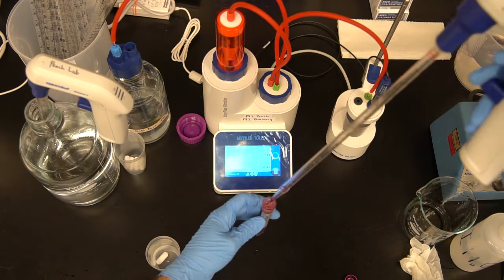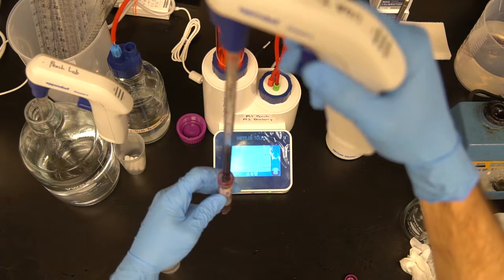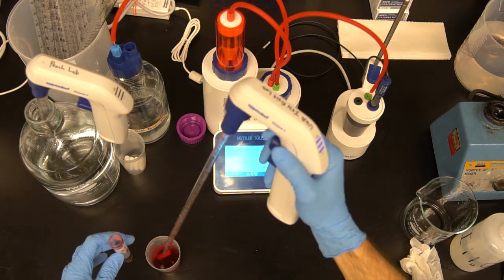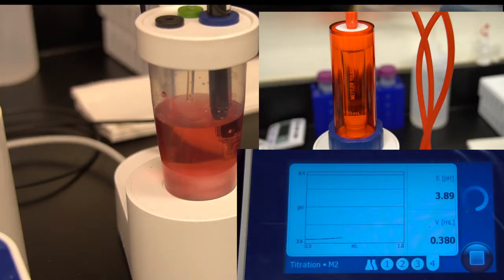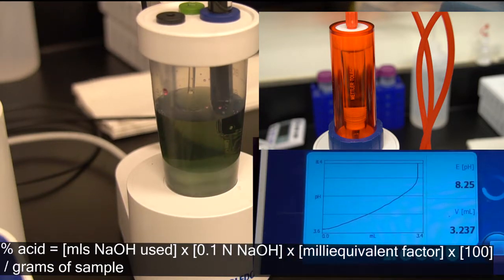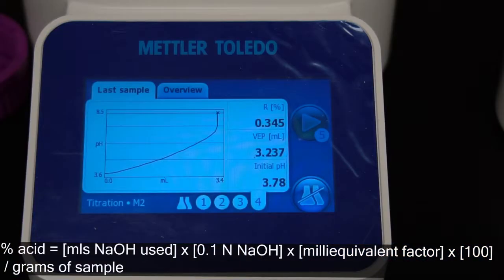A titration consists of taking 6 milliliters of centrifuged juice and adding it to 50 milliliters of deionized water and placing a pH probe in the solution. For this titration, 0.1 normal of sodium hydroxide is slowly added to the solution until an endpoint pH of 8.2 is reached. The amount of sodium hydroxide required to reach this endpoint pH of 8.2 is used in the calculation to determine titratable acidity. The predominant acid contained in blueberry fruit is citric acid, so total titratable acidity is expressed as % citric acid.